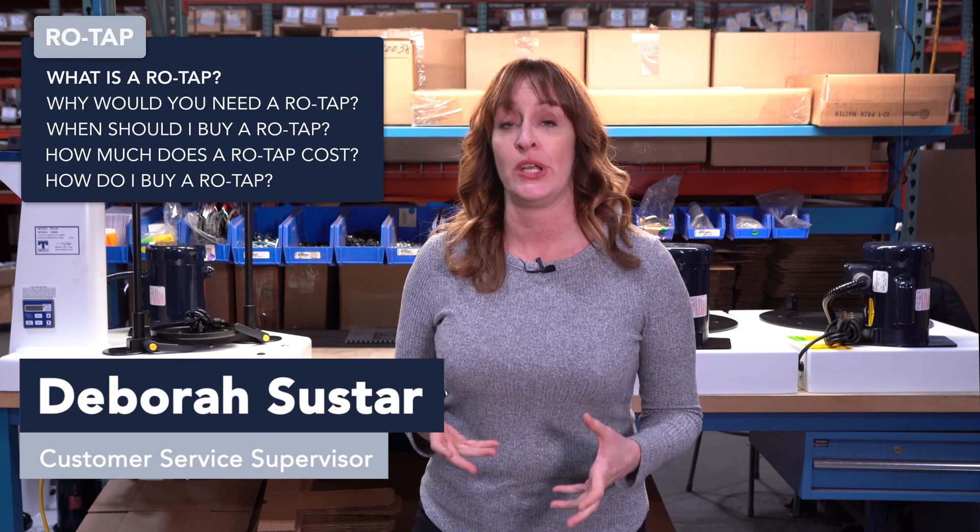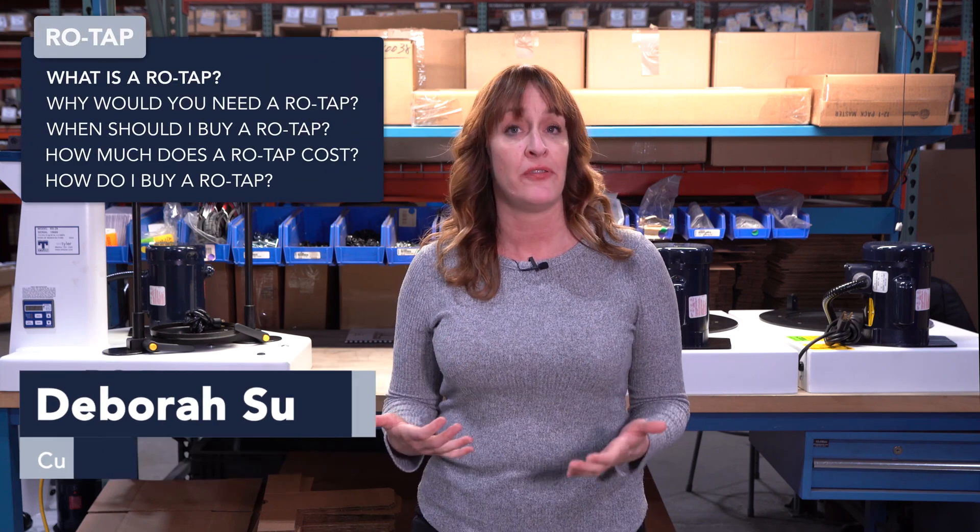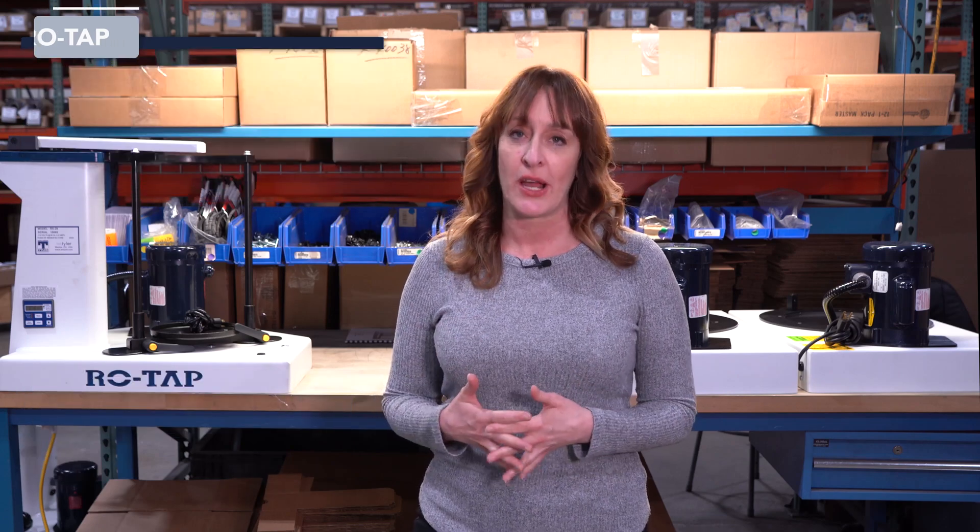Hi, I'm Debra with W.S. Tyler. Today we're going to show you the ins and outs of the Rotat Machine and how it could possibly benefit your particle analysis process.